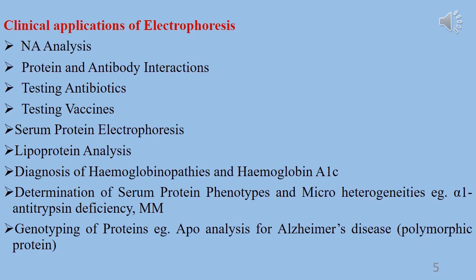Immunoelectrophoresis can also be used to detect specific proteins called immunoglobulins, which act as antibodies. These are part of the body's immune system and attack foreign proteins such as viruses and allergens. Analyzing these antibodies can be helpful to identify new therapies to treat those invaders and also provides insight into conditions such as allergies and autoimmune disorders, which can result from malfunctioning antibodies.